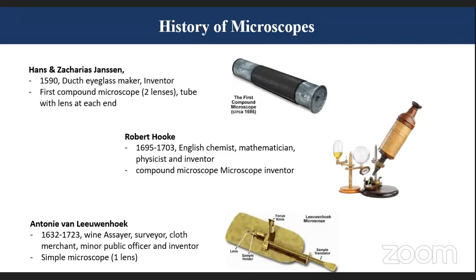Why do we need illumination of the object which we are observing? Mainly because, as the magnification increases, you are collecting light from a very small area. If you are taking light from a very small area, the chances of the photons you are collecting through your glasses or lenses are very low. So most of the time, the object looks very dark and you cannot see anything. So it is important to illuminate the object so that you can observe it better.